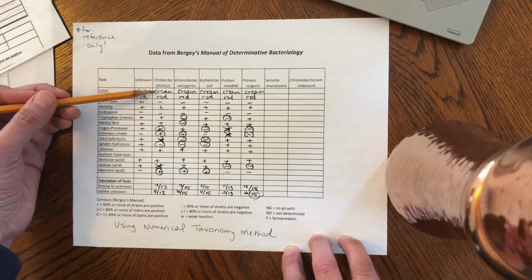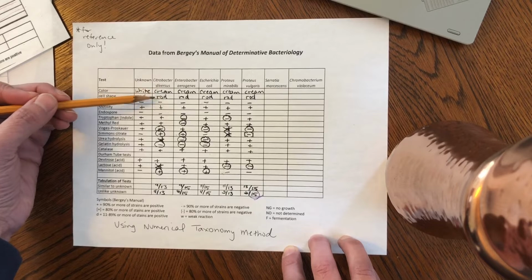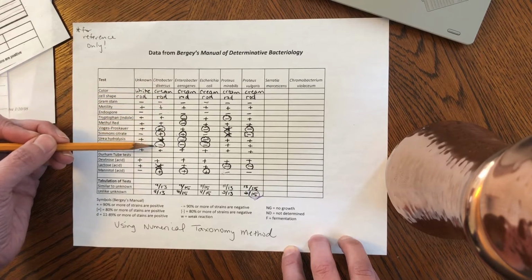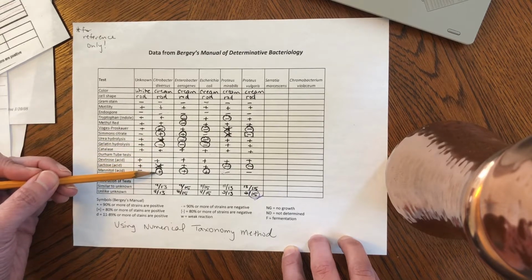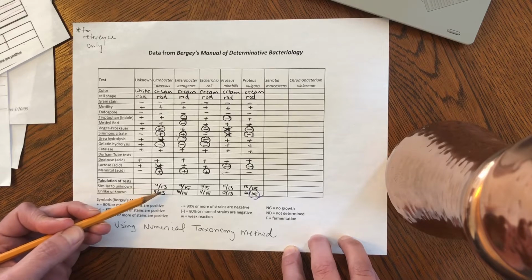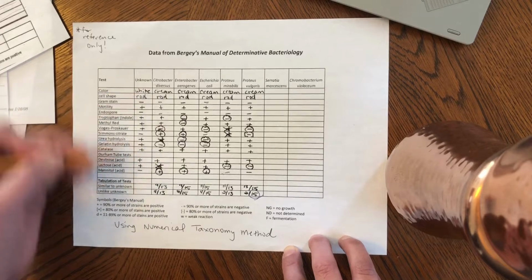So we've got 1, 2. Right now we're going to get this bottom number, this 13. 1, 2, 3, 4, 5, 6, 7, 8, 9, not going to count that D, 10, 11, 12, not going to count that D, 13. So that's how I get 13 tests. Those are 13 tests that I can compare my unknown to.